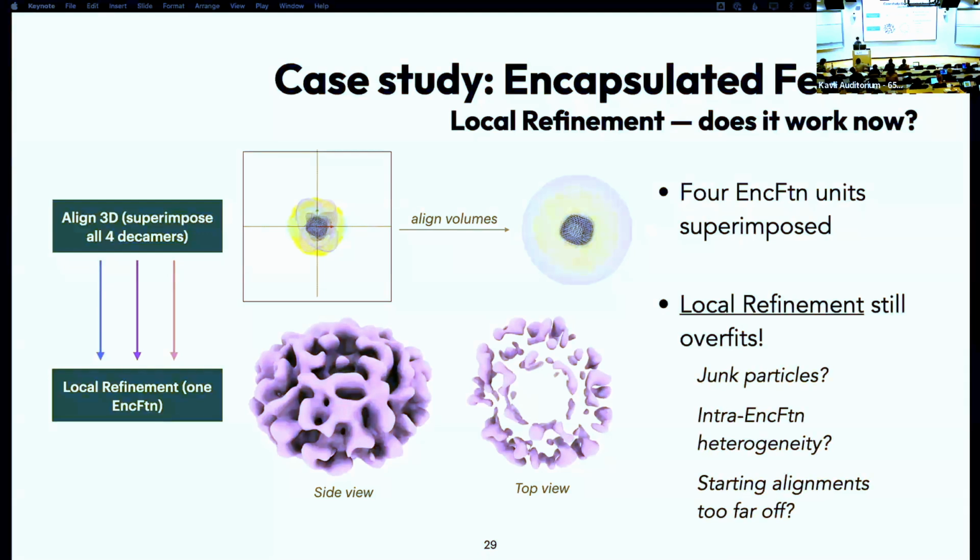At this stage, though, we haven't actually done any particle curation in 3D. So I picked about 250,000 particles from that initial curation of the 2D classification job, which I didn't show. But for those 250,000, I did no curation in 3D. I went straight to ab initio, then refinement, and never did any kind of filtering. And we kept all volumes, of course, from the previous classification job, so they're all still there.